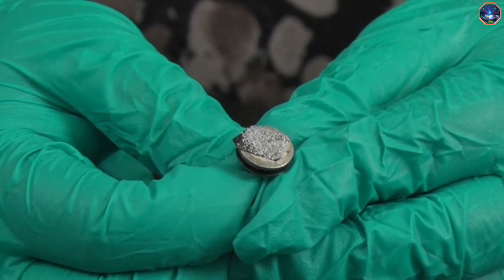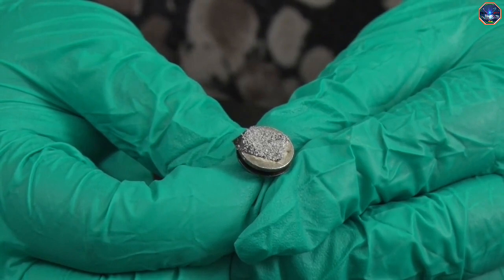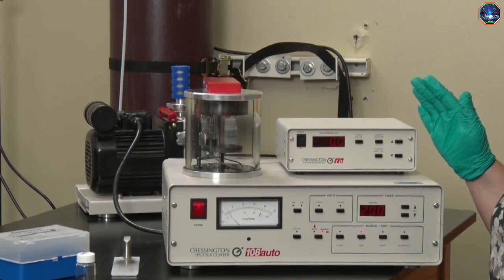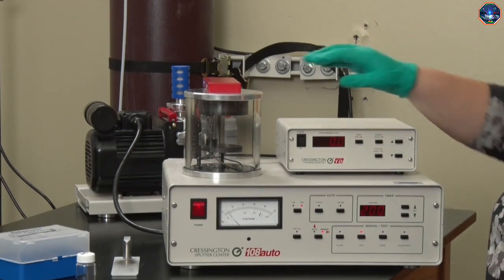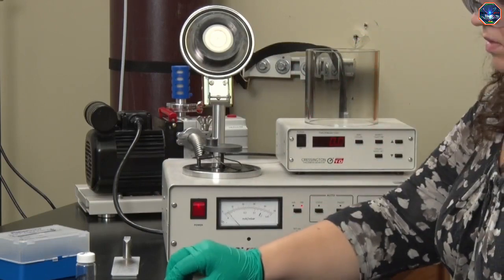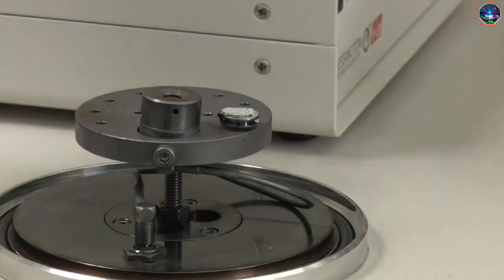Samples that are not conductive need to be coated with a conductive coating for traditional SEM imaging in order to prevent charging problems. Our lab uses a sputter coater to deposit a thin layer of gold-palladium, but some labs use a carbon coating instead. I'll place the sample in the sputter coater. The metal that we will deposit is actually held in the lid, and the small circular disc just next to the sample is called a quartz crystal microbalance. It can measure how much material has been deposited.